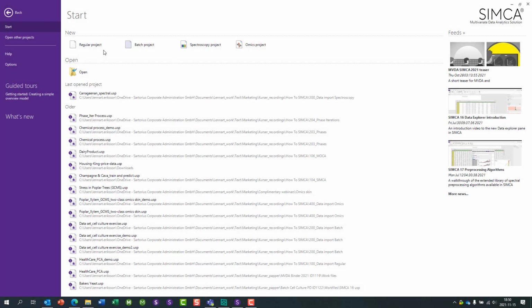When setting up a project in the SIMCA software, there are 4 entries: the regular project, batch project, spectroscopy project, and the omics project. In this how-to video, I'm going to show you how to set up a spectroscopy project.